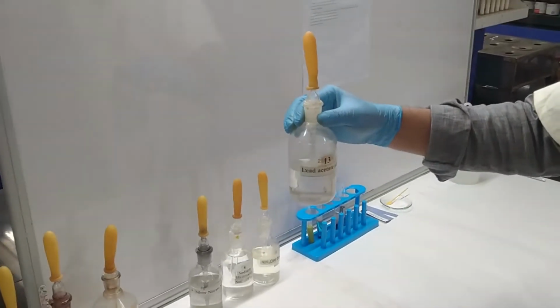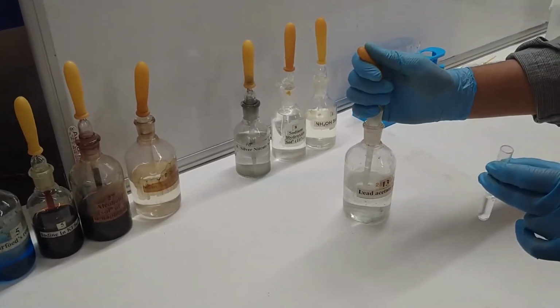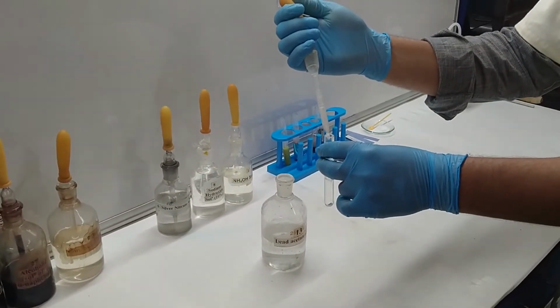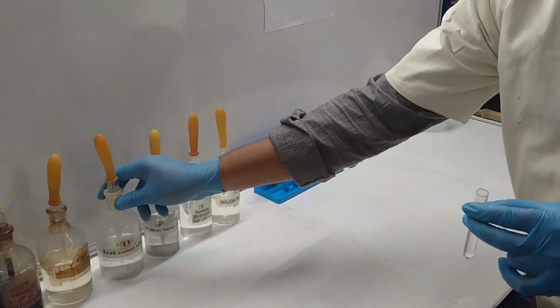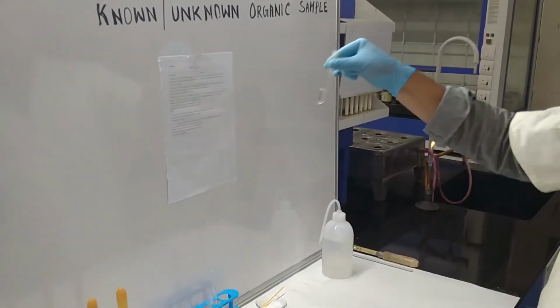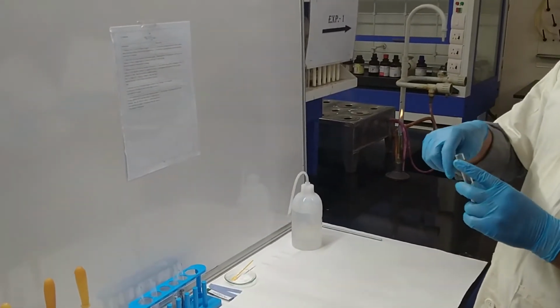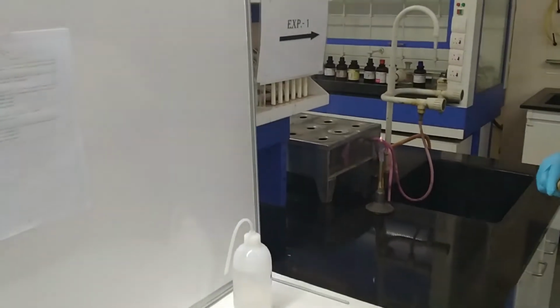Okay. After adding lead acetate solution, we have to heat this mixture for a few minutes.